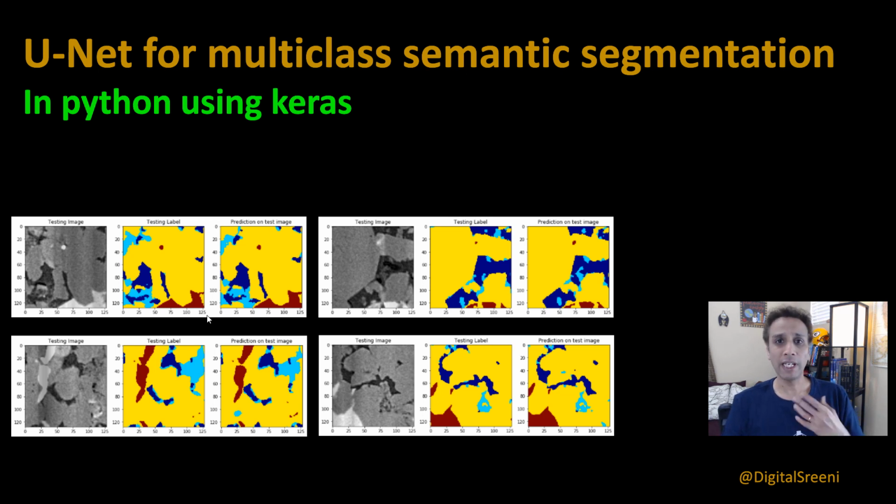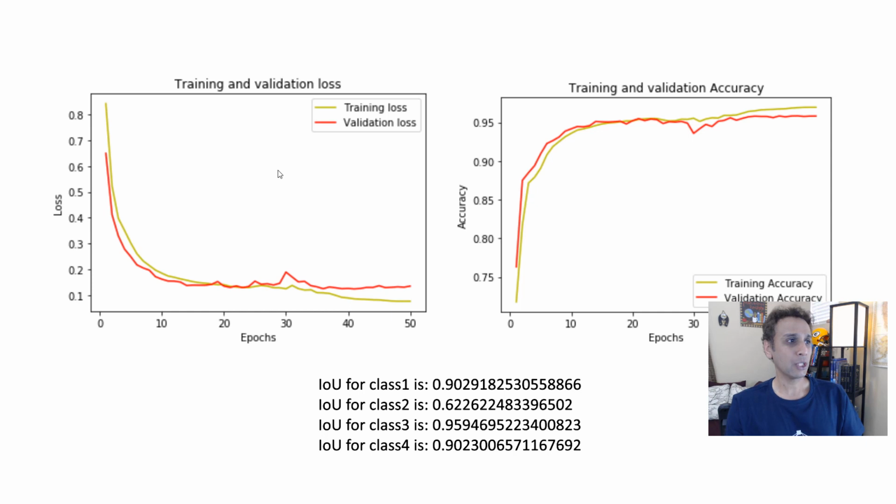Now, I've already run this once just to show you, because I don't want to waste your time running it live. Of course, you can do this yourself. I just want to show you the end result, right? It probably took about 25 epochs or so to converge to get to the best performance, in terms of loss and also in terms of accuracy.